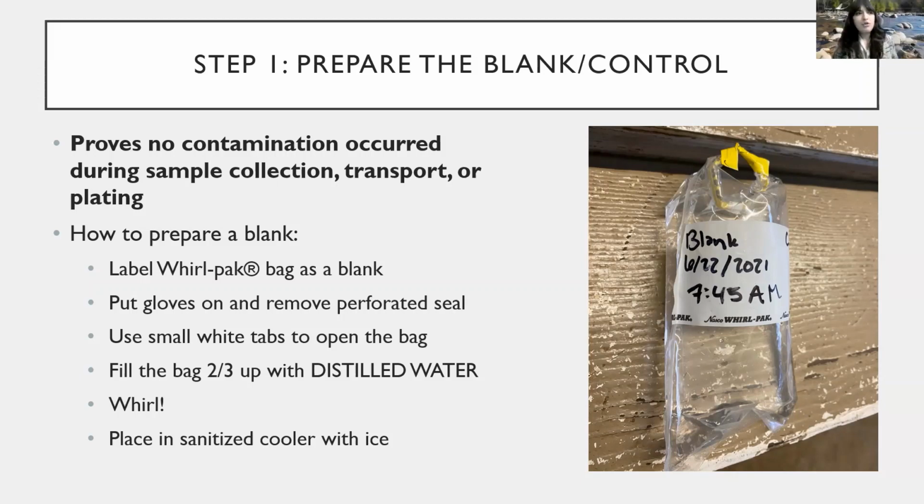There should be no bacteria of any kind present on your blank once you incubate it and grow it. And if there are bacterial colonies on there, then there has been some form of contamination. And if that happens, then you must discard all your samples and redo the sampling process, because the whole point of the blank is to have no growth whatsoever. So how do I prepare my blank?